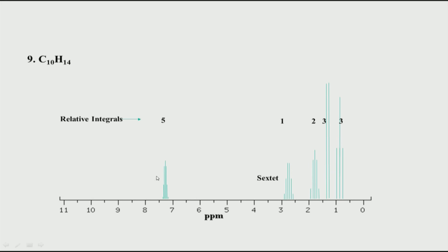So what we normally do is not analyze the aromatic pattern. The reason is that there are two things. One is that there is long range coupling present. So the hydrogens are not only coupled to the 3-bond hydrogens, which is what we typically use when we analyze this type of data, but also to hydrogens 5 bonds away and so on. And these are strong couplings, in the sense that the chemical shift difference between them is very small and the coupling is bigger than that. So we have what is called a strong coupling scenario, and because of that the peak pattern you see in the aromatic ring is not straightforward to interpret compared to what you see here.